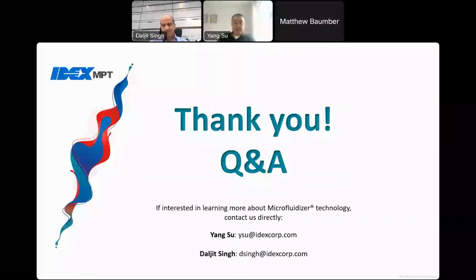Yeah, so like I said, we have designs of different production scale machines. The design is primarily to ensure we have a pumping system that is capable of delivering higher throughput. They will be using our same interaction chamber technology. So everything you have done with the lab scale processes can scale directly. We will choose the same interaction chamber design. We will determine the number of microchannels inside to meet the capacity of the system. So basically, you will be ready to process a larger batch. There are a few considerations usually when you scale up, but I think we can discuss in more detail offline if needed.